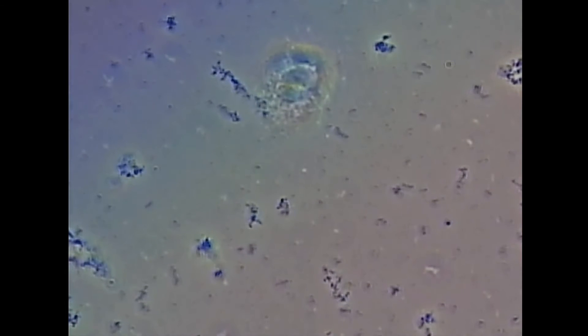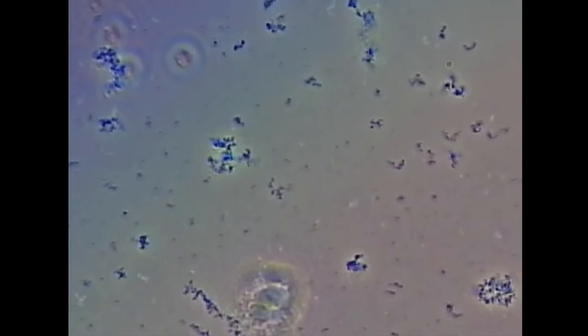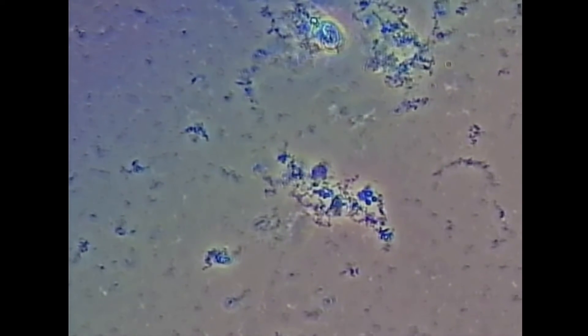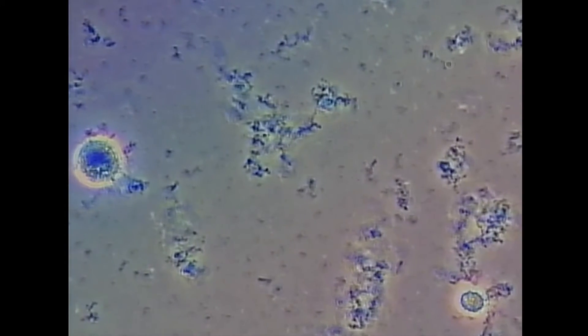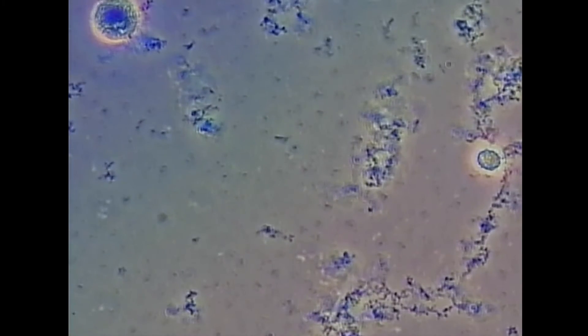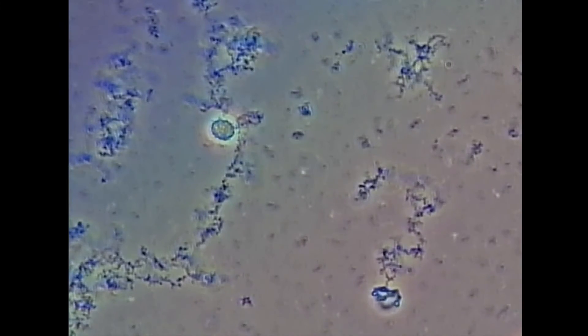Our patient looks like she's doing what she's supposed to be doing, because I'm not seeing any evidence of recolonization of the pathogenic bacteria. One of the nice things about having this type of technology in your office is it's easy to confirm if the bacteria are truly gone or not. What we're looking at is a phase contrast microscope from Auratec, at 400 power.